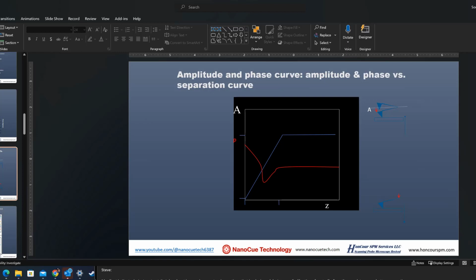Oh, yeah, thanks. If possible, we should run an experiment. Let's cool down the sample. Remember, I showed a topographic image of a piece of ice. So it's ice, and there's no longer a water layer. I forgot to measure a force curve. Otherwise, I could tell you whether it's a water layer, because the test sample is at negative 20 degrees C. There should be no water layer.